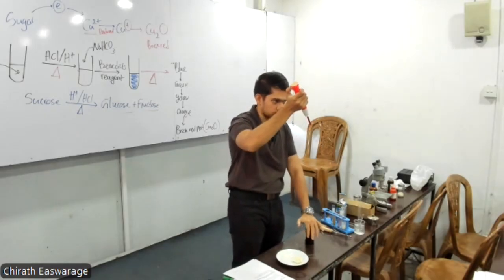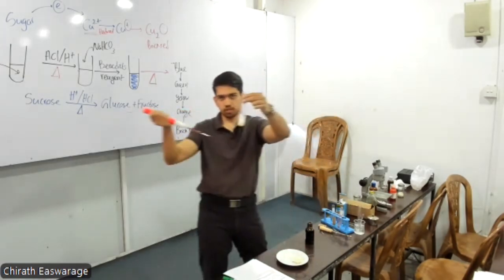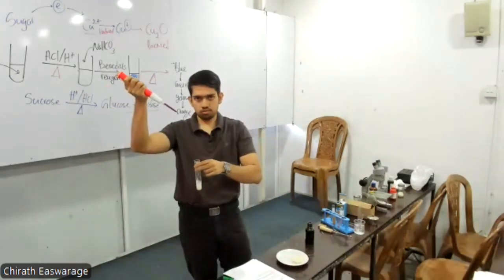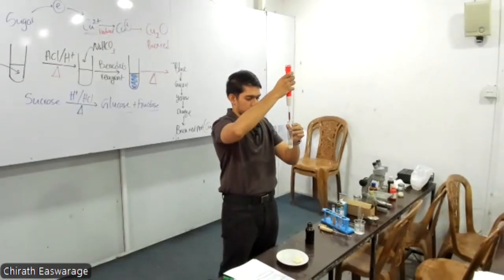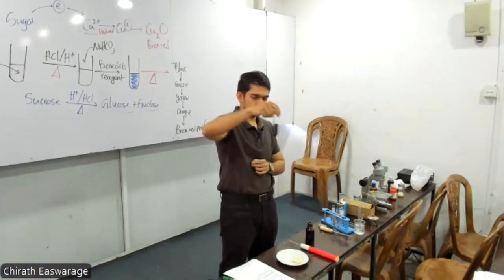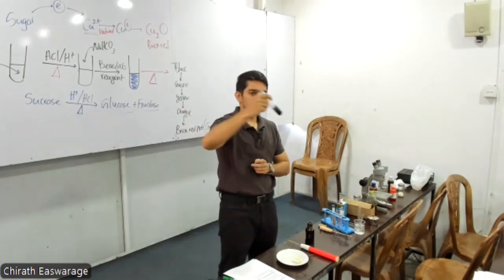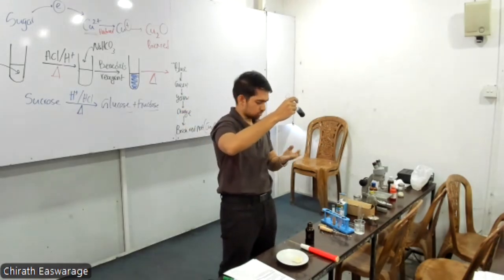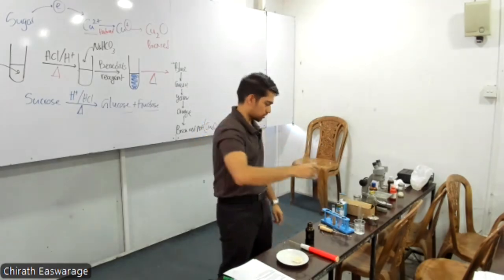This is because it's concentrated, otherwise kind of yellowish, right? So what's the color change that we're expecting? This is white starch, brown iodine. When we add it, we're supposed to get black brown. Blue. Can you see, purple, sort of purplish, blackish starch? Okay, very simple test.